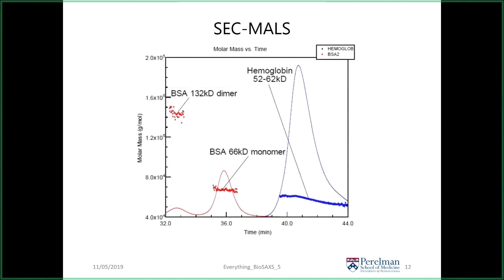The intensity of scattering varies as the square of the particle size, so bigger things scatter more strongly even if they represent the same mass proportion. SEC-MALS data is presented as a double-Y plot: on one axis you have the UV absorbance trace, on the other you have mass measurements. Plotted over the gel filtration traces are clusters of one-second mass determinations. For the BSA monomer you see 66–67 kDa, well resolved. For hemoglobin, the peak is a little irregular and the mass profile drops from 62 down to 52 kDa, possibly due to missing heme groups or degradation.